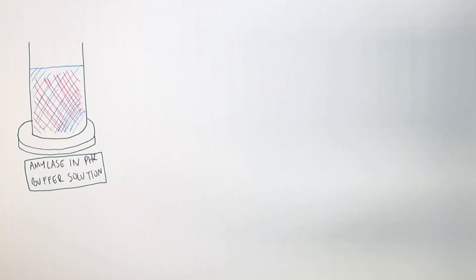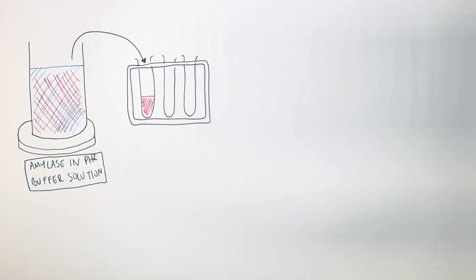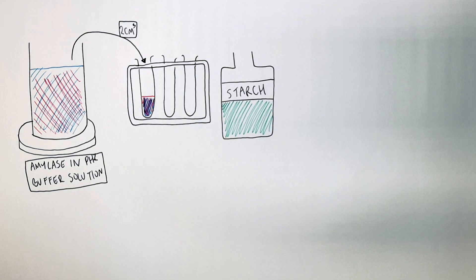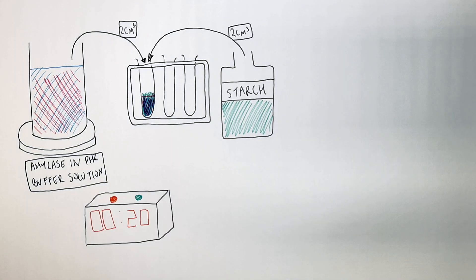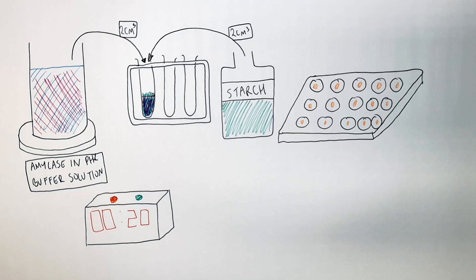Now repeat the experiment for a different pH. This time, mix the amylase enzyme in a pH1 buffer solution using the same volumes as before, as these are control variables. Transfer two centimeters cubed of the amylase in pH1 buffer solution into a test tube, then add two centimeters cubed of the starch solution.